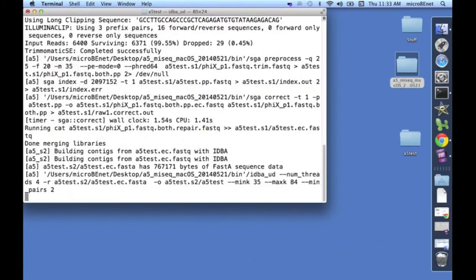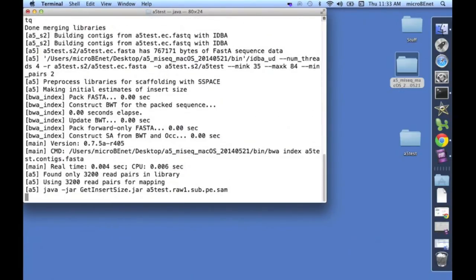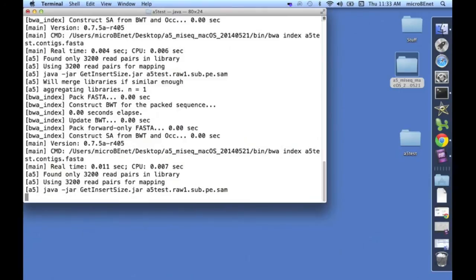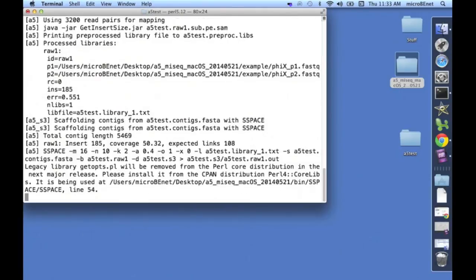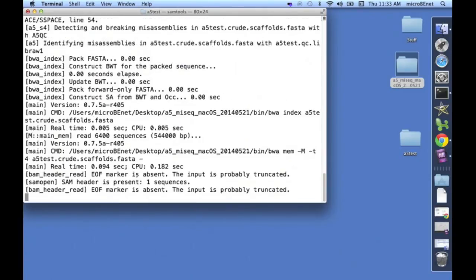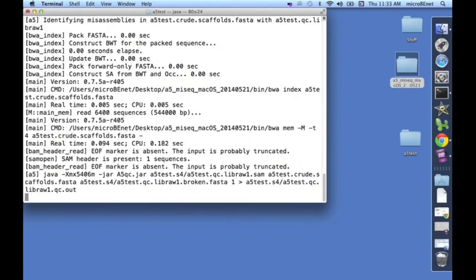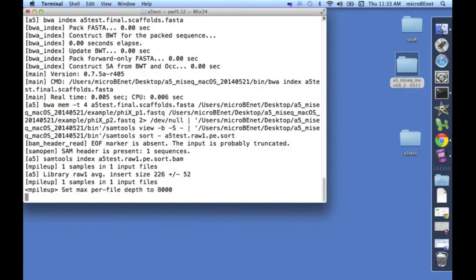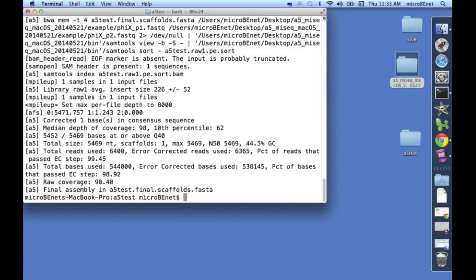On my computer, this should take around 10 seconds. Okay. The assembly is complete.